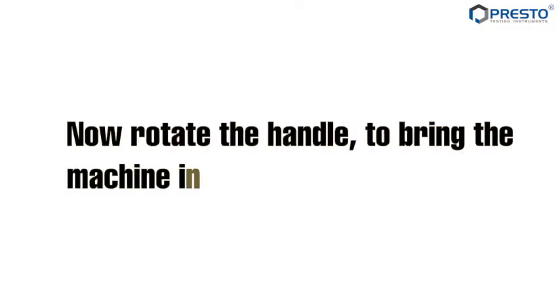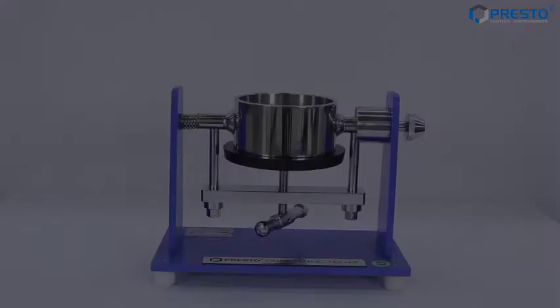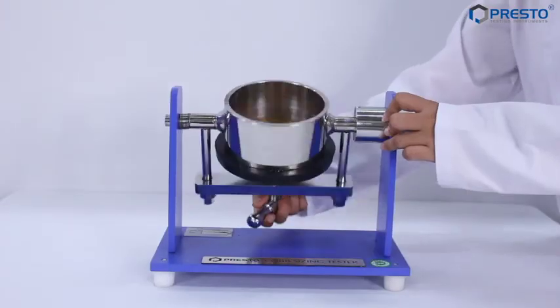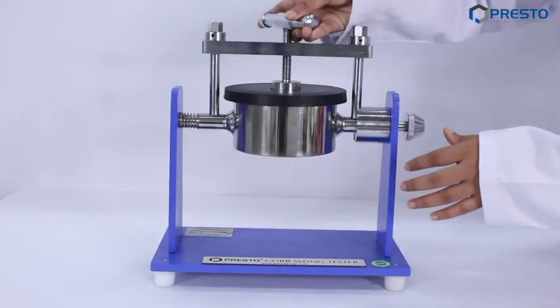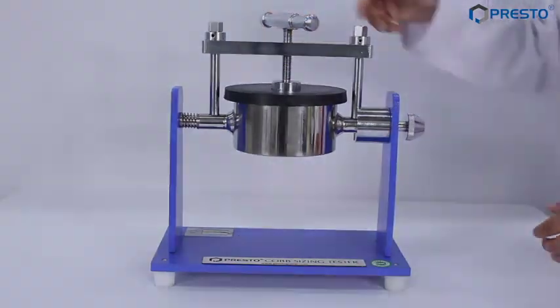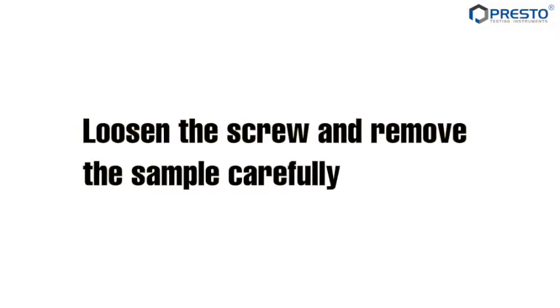Now rotate the handle to bring the machine to its original position. Loosen the screw and remove the sample carefully.